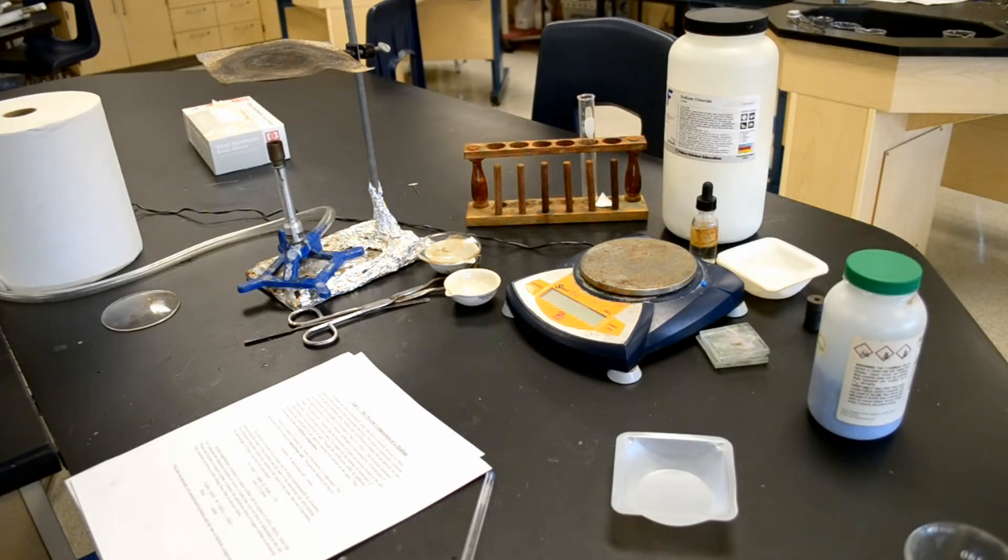In this experiment, a hydrate of copper sulfate will be studied. CUSO4·XH2O. Note that the X indicates the unknown number of molecules of water that you will have to determine in this lab.